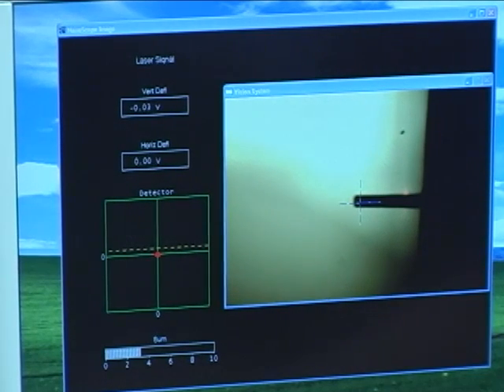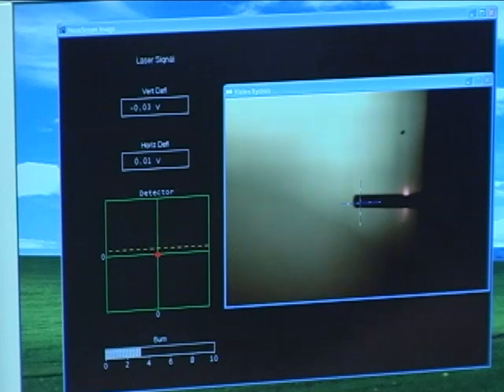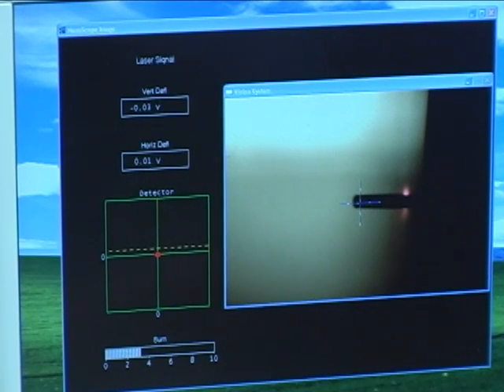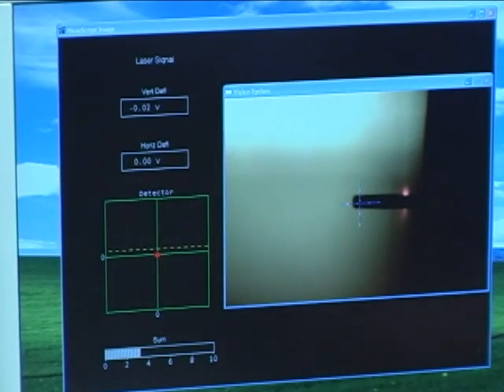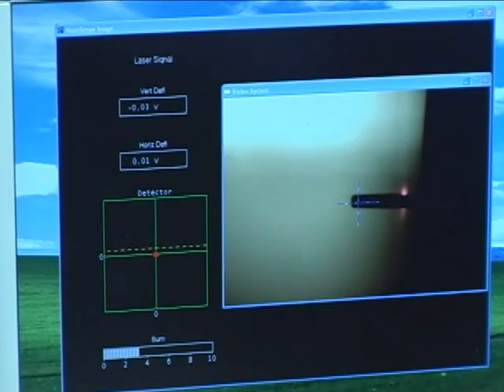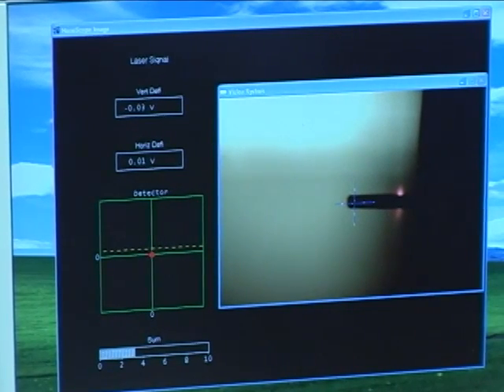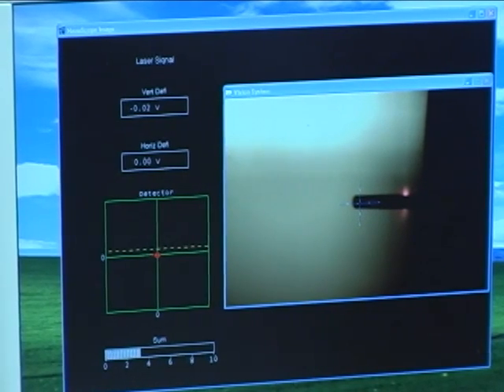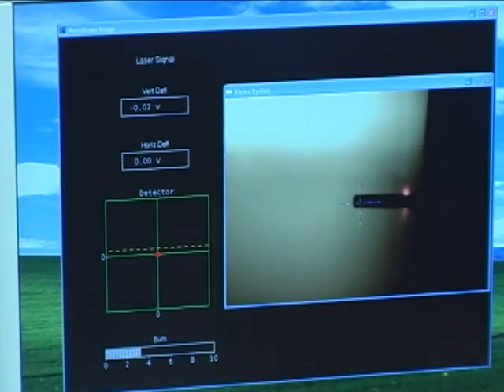I'll adjust my illumination slightly. And then using the trackball, I'll move around on my surface until I find a region that is of interest to me or just happens to be clean. When that's done, I will then click out of this menu. And I will set my software settings to be prepared to engage the tip with the sample.